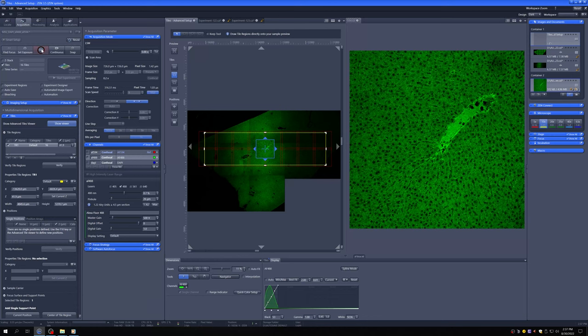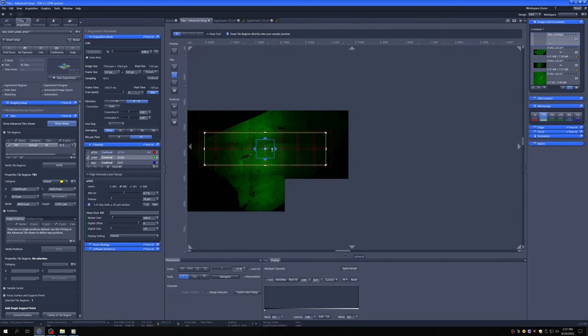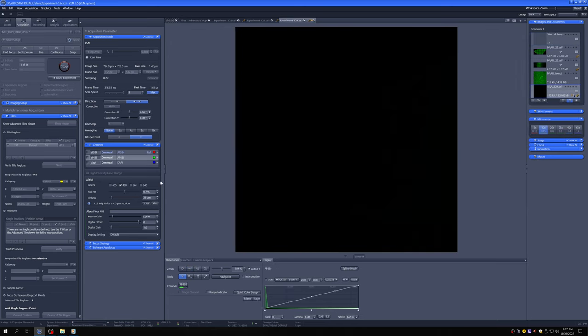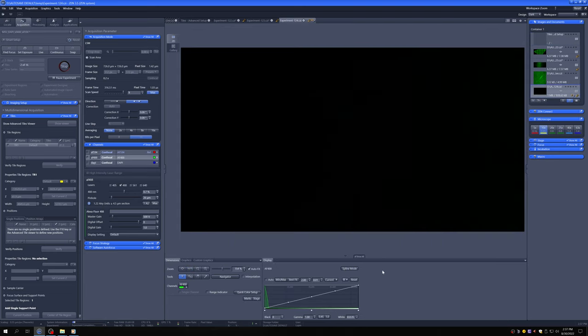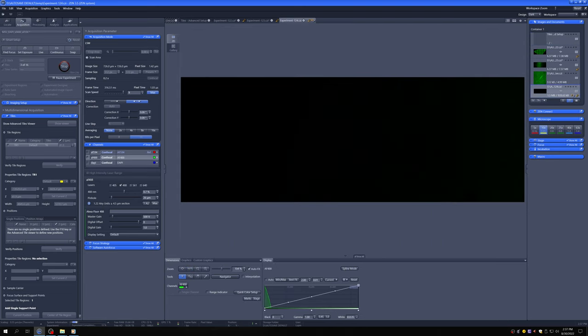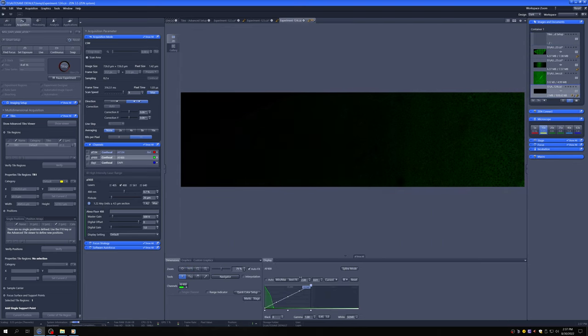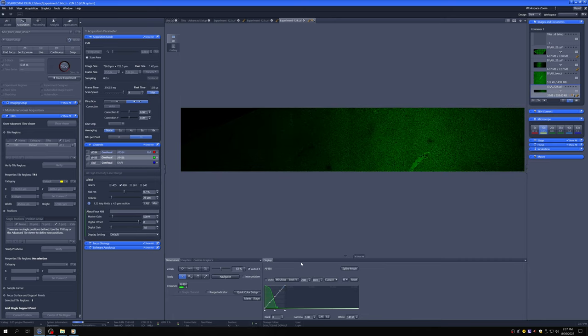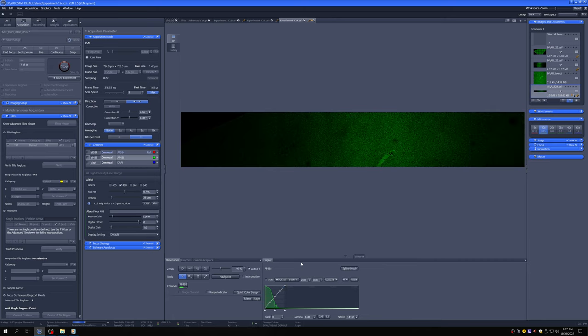So I'm going to set the Z and I'm done. So this assumes that whatever's in the middle of the tile, if it's in focus there, it's going to be in focus in the entire tile. So let's see if that's true. And you'll see that it is definitely not true because the slide is tilted.